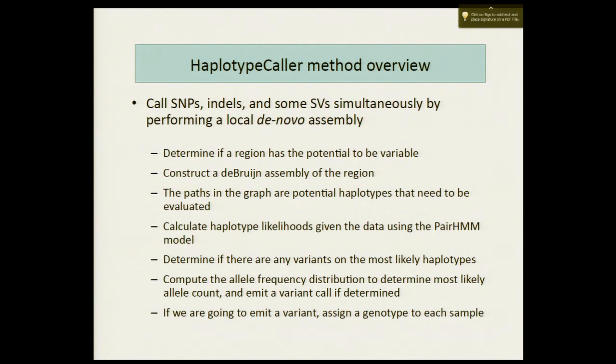Anything else? Actually, I had a case where I artificially introduced errors into my BAM file. I had a very high error rate, and the indels didn't get called at all. Have you seen that before? With the traditional indel realigner and everything. Is this with Unified Genotyper or HaplotypeCaller? Unified Genotyper.